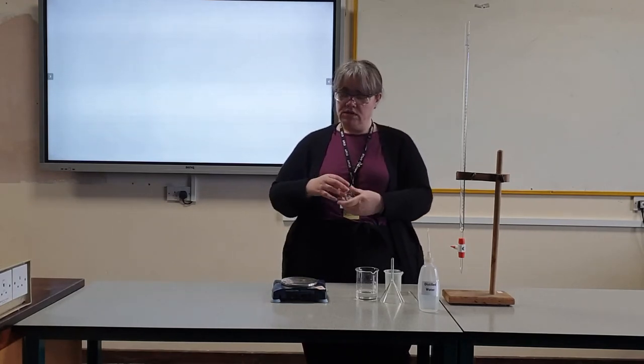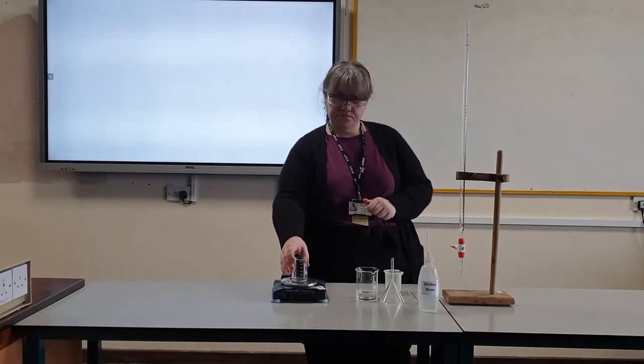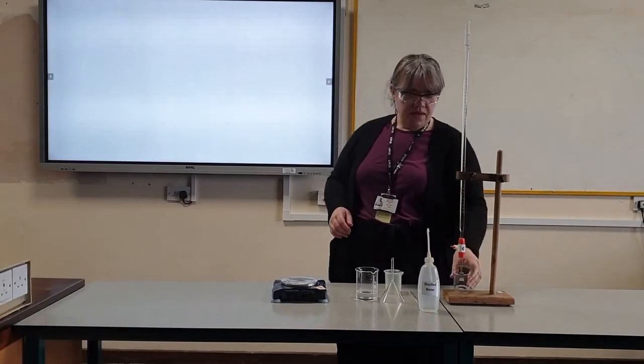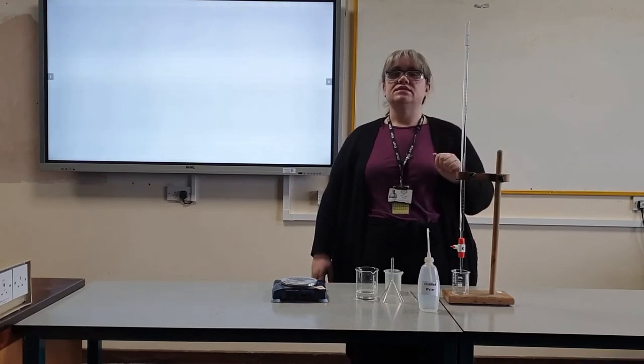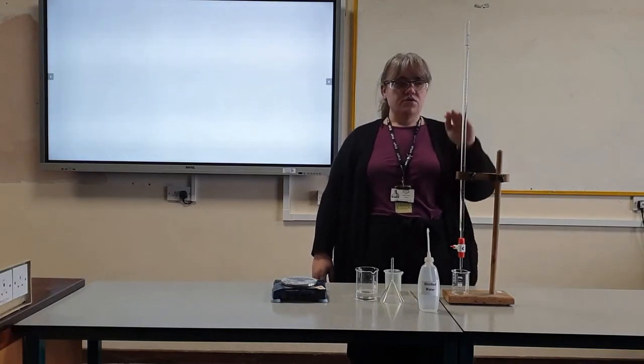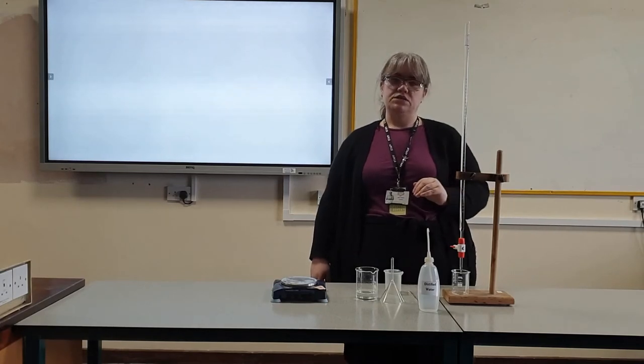Take the beaker that I'm using to record and I will write down the mass of that beaker. Put that beaker underneath my burette. I've left it for five minutes and the meniscus is still at zero.